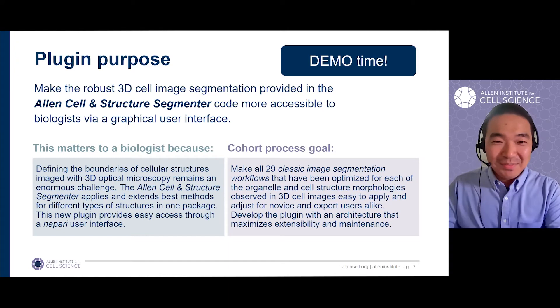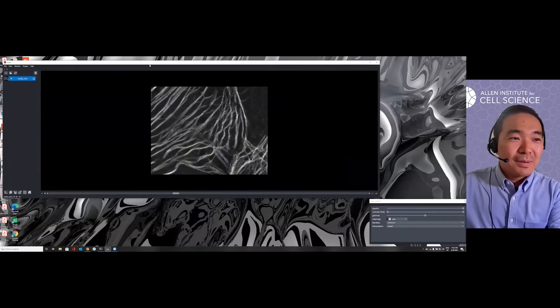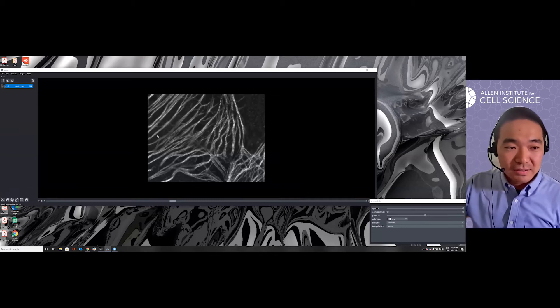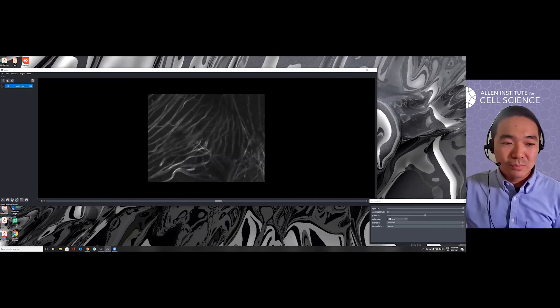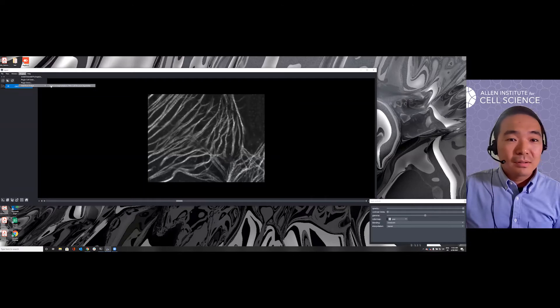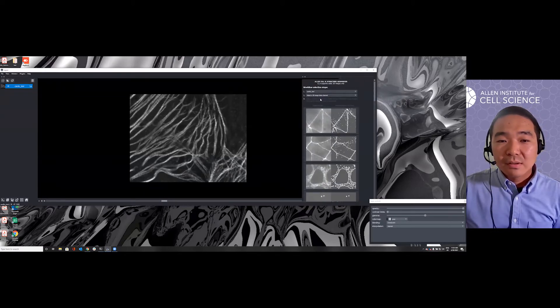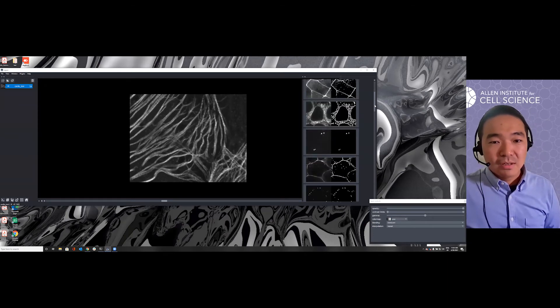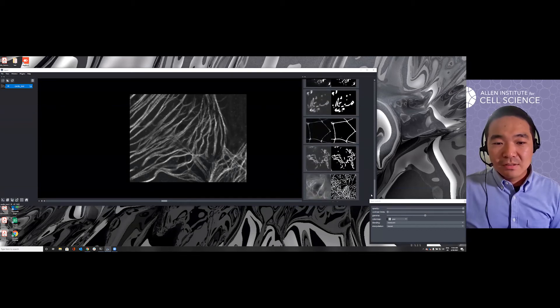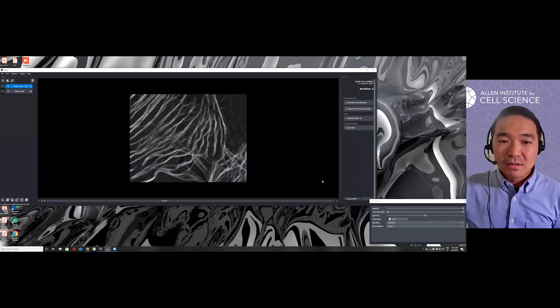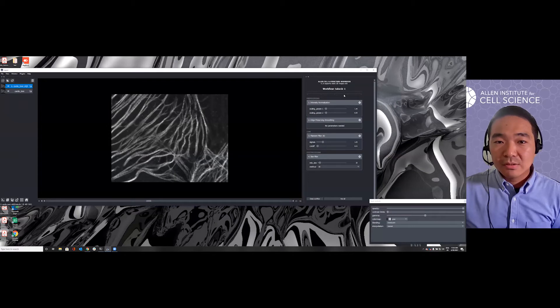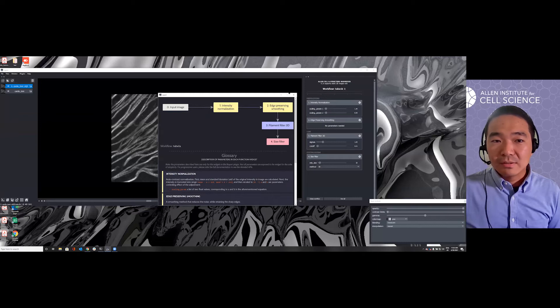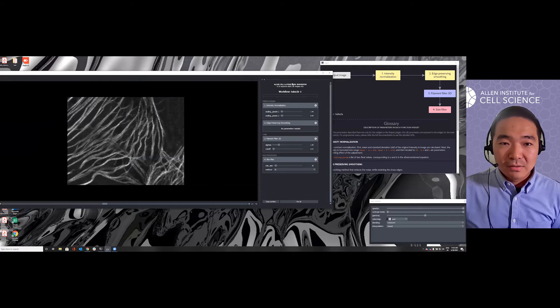Okay, now let's do some demo. I have my NAPARI window opened and one image reloaded. This is the desmin in cardiomyocyte and we want to get some segmentation out of them. So here first we load the plugin and then select the image, select the channel.